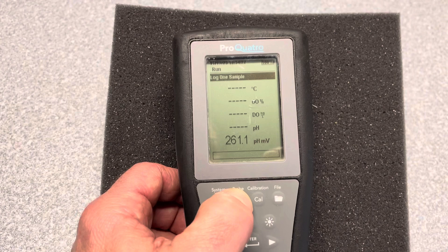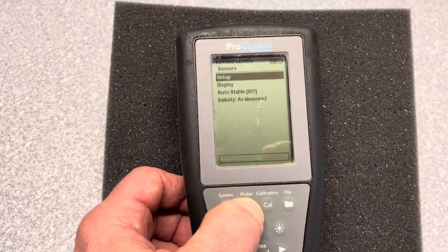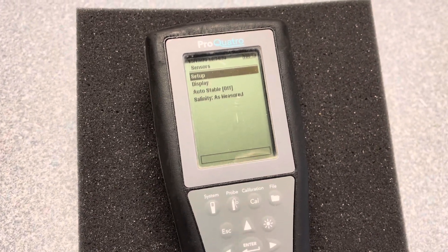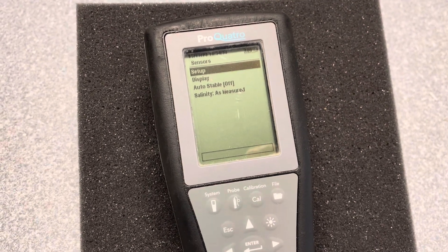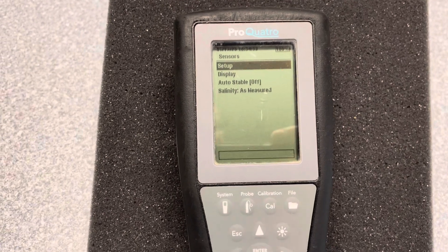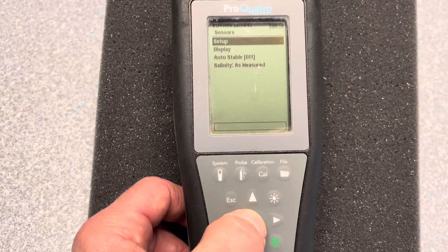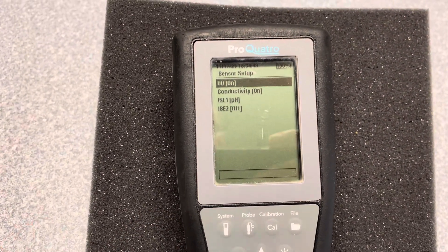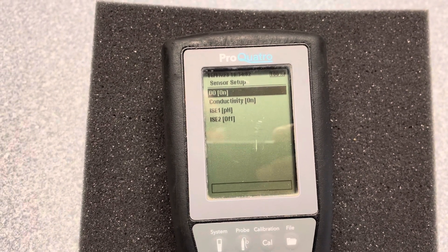The first thing we want to do in turning on and off a sensor is hit the Pro button. You would want to turn on or off a sensor if you're actually adding a sensor, or you're going to remove a sensor and you don't need to read and report it. Once we have that pressed, we're just going to hit Setup. Here we can see on this meter we have DO is on and Conductivity is on.